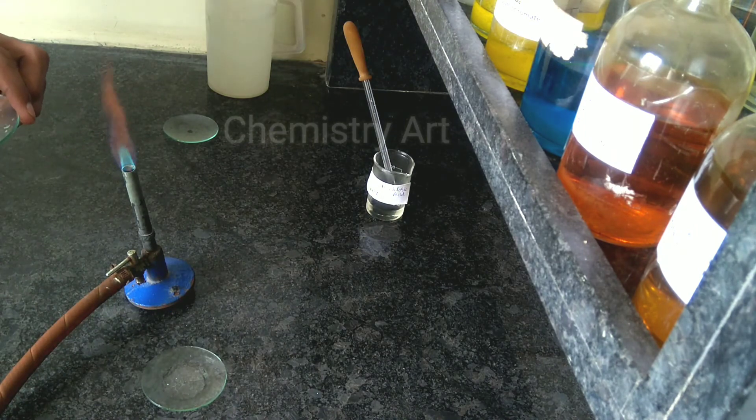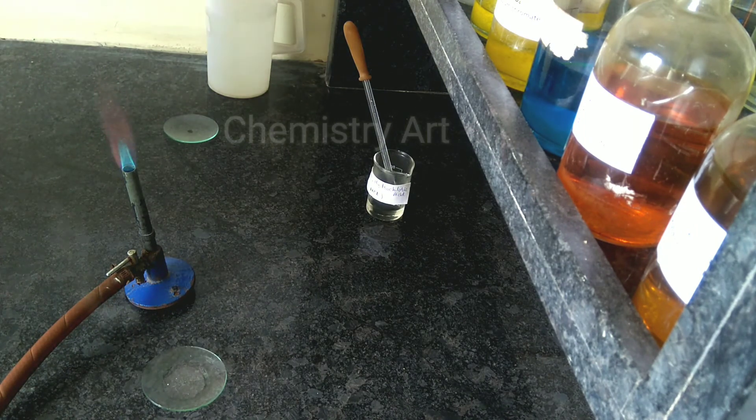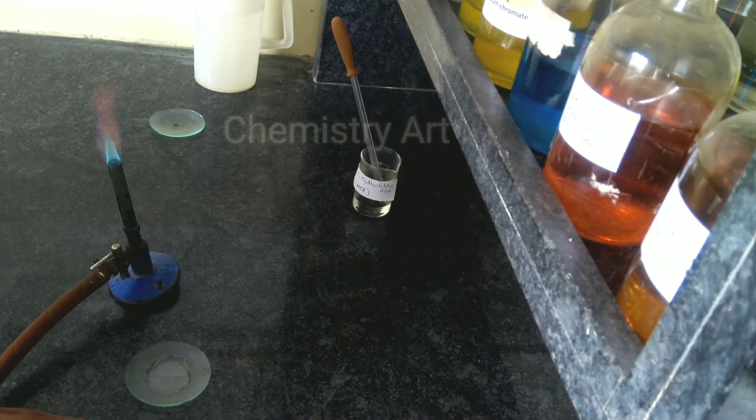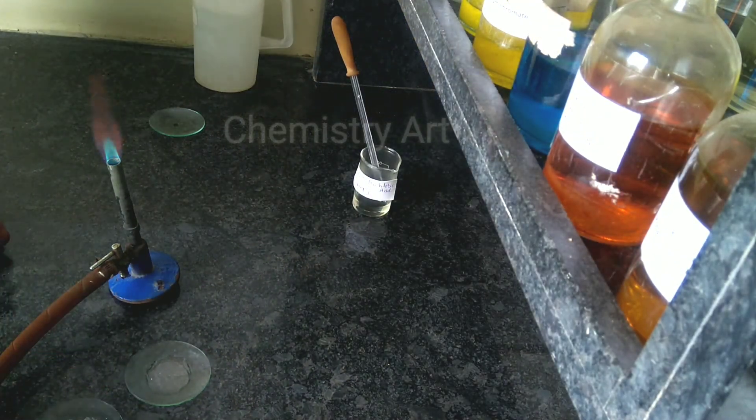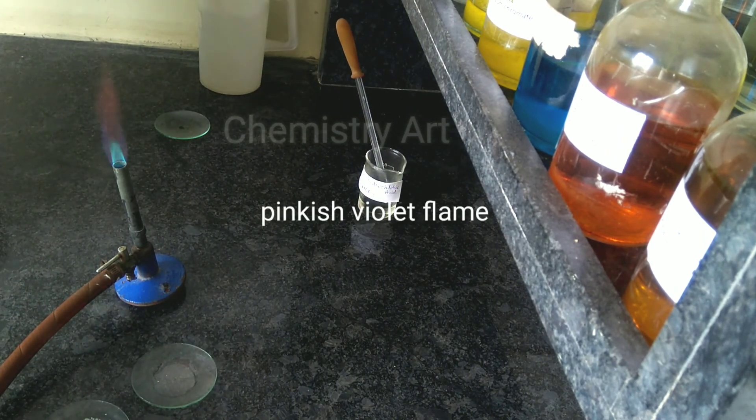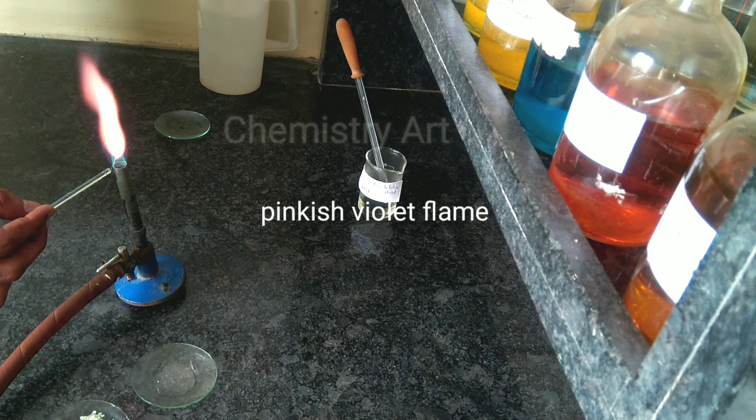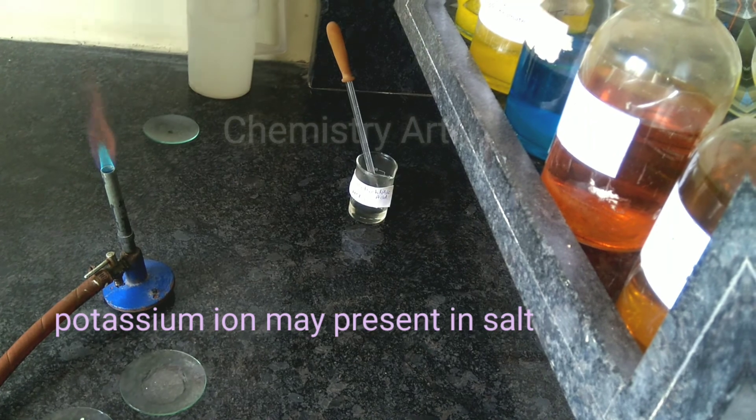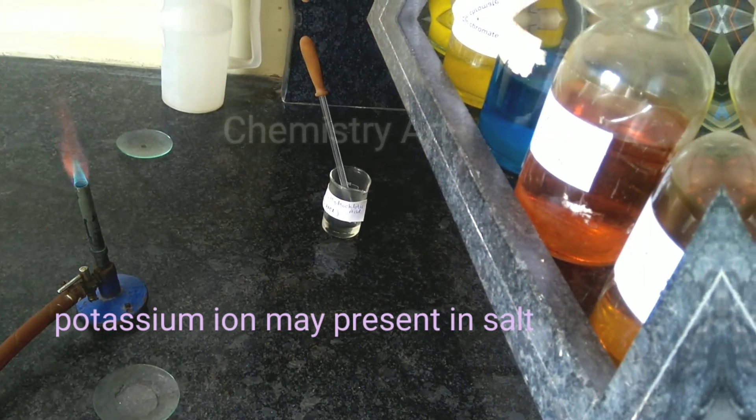This is the third salt. I have added the concentrated hydrochloric acid and the paste is ready, but before that once again you have to clean the platinum wire. Here you can see it is giving the pinkish violet color, showing that potassium ion is present in this salt.